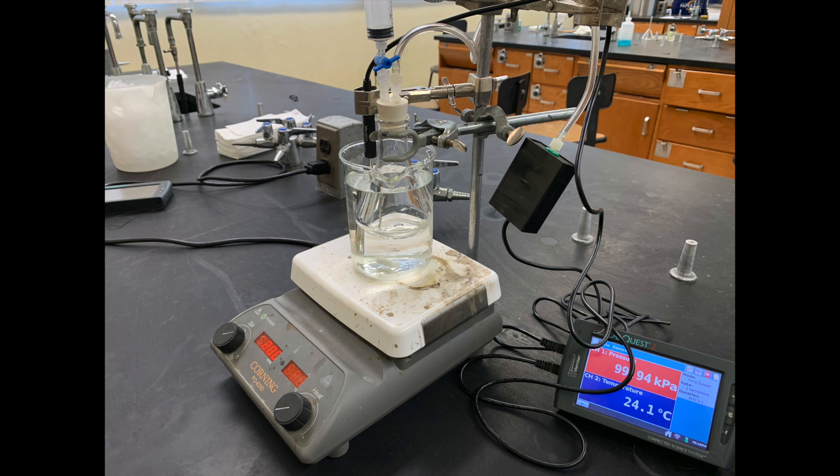This experiment will measure how the vapor pressure of methyl alcohol changes with temperature, and that will be used to calculate the enthalpy of vaporization.